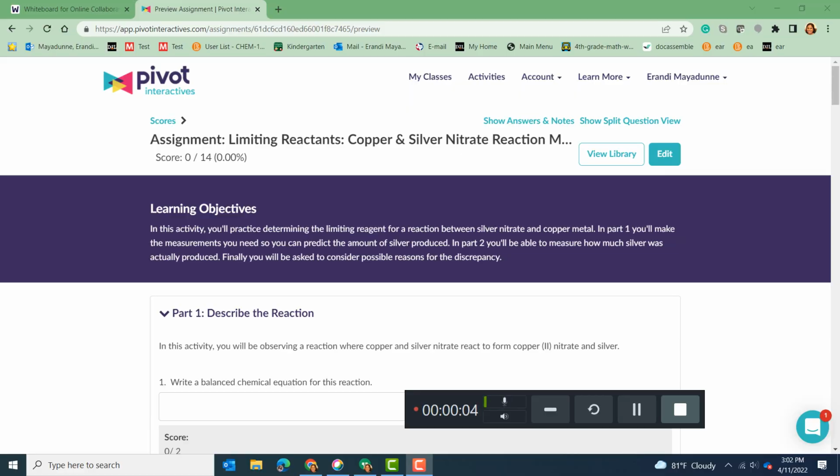I am here to give the introductory lecture about the limiting reactant. The lab is the copper and silver nitrate reaction. Before even looking at the lab, it's a reaction between copper and silver nitrate. The very first part of the lab asks what type of reaction this is.